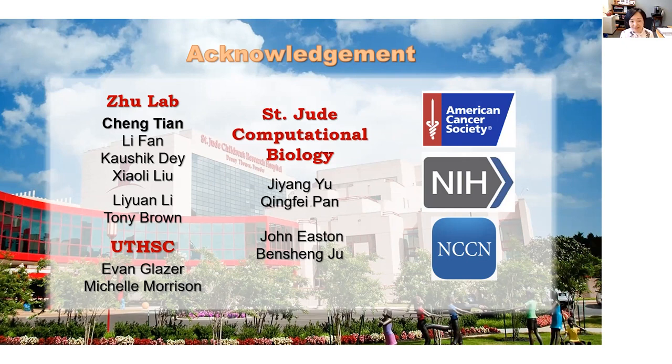So we think PMFs and IMFs work differently also because of their neighborhood, their friends or team members. If there's a very strong team coming together, then they can fight other cell types more strongly. But if they're disseminated, then by themselves they tend to probably coordinate with the other cell types around them to try to survive. That's just a hunch that we get from observing the cell behavior changes there.